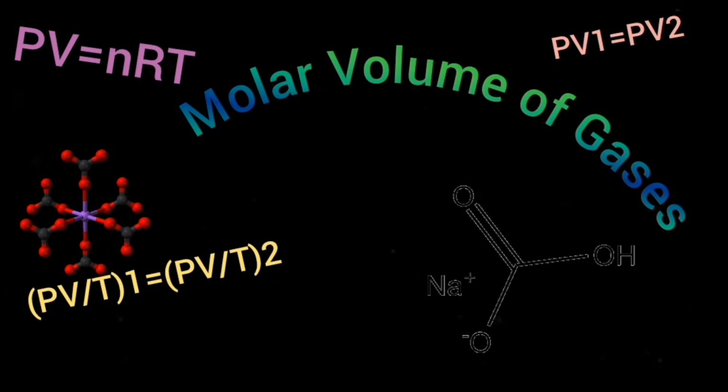Hello, and welcome to the post-lab reflection for the Module 7 lab, molar volume of gases. In this experiment, we're going to be making an at-home version of a eudiometer in order to capture the gas produced in a few reactions. By observing the water displaced by the gas that we capture in the reactions, we will be able to verify the molar gas volume of carbon dioxide.